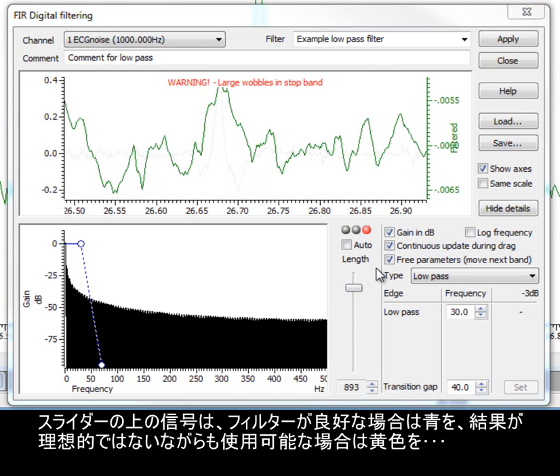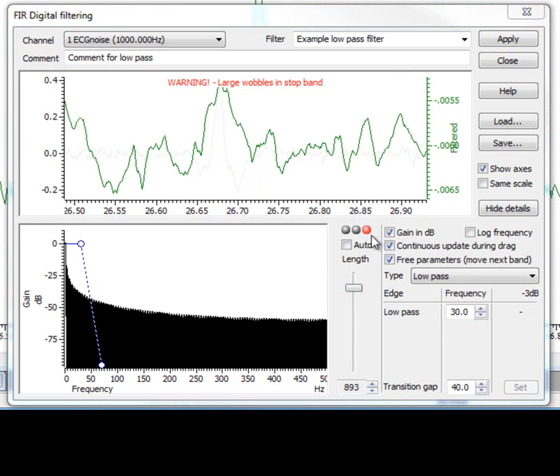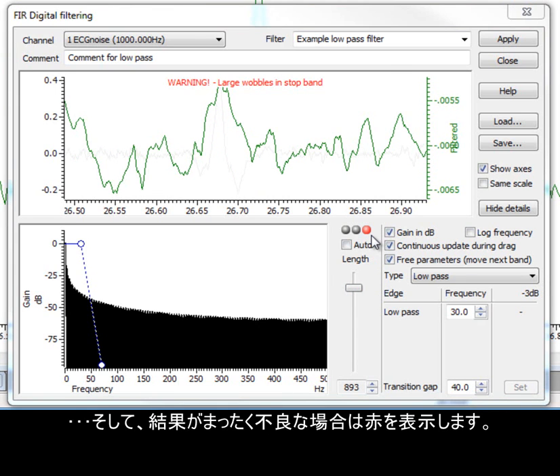The traffic light system above the slider displays a green light if the filter is good, amber if the result is not ideal but still usable, and red if the result is no good at all.